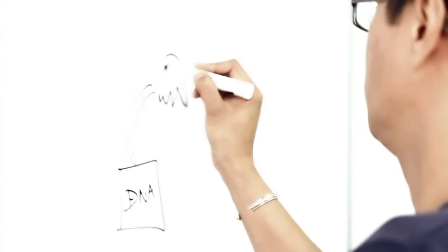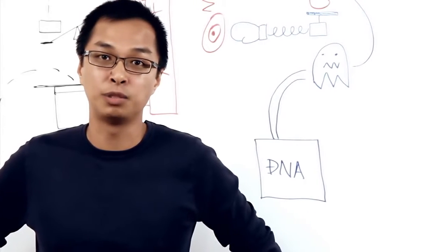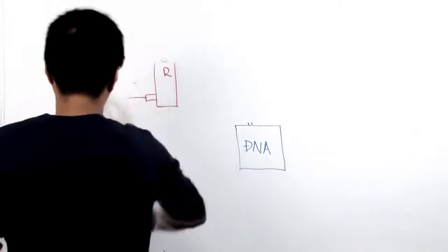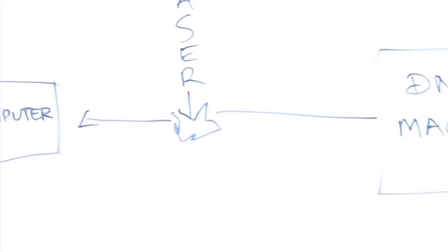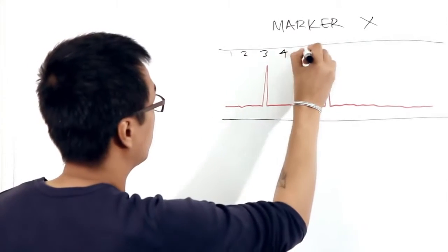What happens at the lab? The sample of blood from the t-shirt is extracted, and we're going to look for the DNA on the shirt. So lab analysts run the amplified and extracted DNA through a machine that involves a chicken. Actually, it looks more like this. Sample goes into a machine, results are read by a laser after going through a capillary tube, and are interpreted by a computer. So the laser in the machine actually measures which markers are present and how much amplified DNA we have.